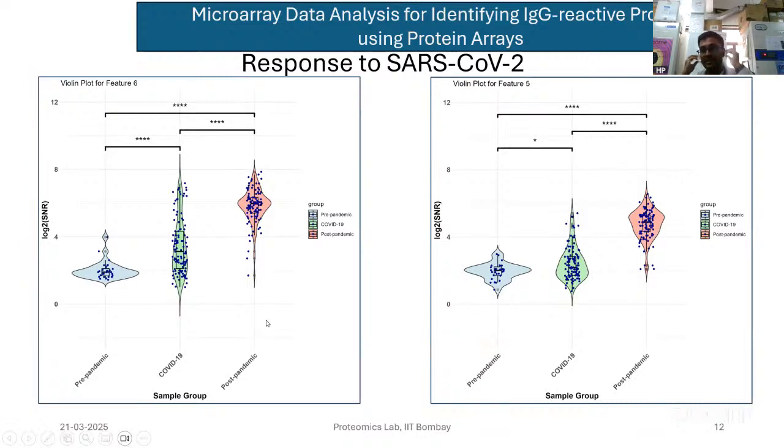Yes, we have developed our indigenous code. So you can find the star which you are imposing here. This is completely indigenous. We just need to find the p-value from this significance, from our analysis, and it will automatically fix the star. So this way we proceed. We have just recently completed the project, so we have given you glimpses of that.